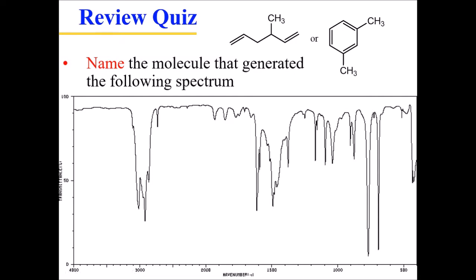At 1500 is where I see the carbon-carbon bonding that's common with organic chemistry. And now what I'm doing is getting into the region of the spectrum where I have a lot less confidence. Anything below 1500 is really difficult to interpret unless the peaks tend to be incredibly large, which is exactly what's going on right here. Notice that you have a pair of peaks, one that's just below 700 and one that's above 700. And if you remember from the homework explanation that I gave for the last lesson, that suggests that I have a benzene ring that has M substitution. It's either mono or it's meta. And this compound up here is definitely meta.